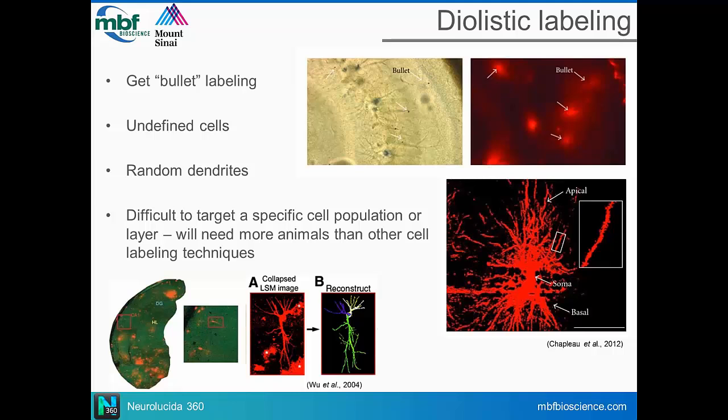Well, it'll make things go much faster as opposed to if you have to trace manually and do all the spine counting manually, which is what I did when I first started here, which took forever. But yeah, no, having an automated software to do that will definitely save so much time, leaving you to have time to, I don't know, do more science.